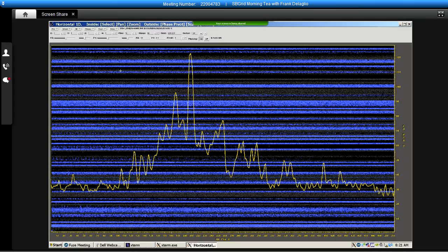So now we can build different schemes to process part or all of the spectral data. And as we mentioned before, this processing is done by creating shell scripts. We can create them with a basic text editor, but the NMRDraw program also has a text editing facility inside of it that will help us create appropriate scripts to process the spectral data. And I can find that text editor under the File menu in the option called Macro Edit.